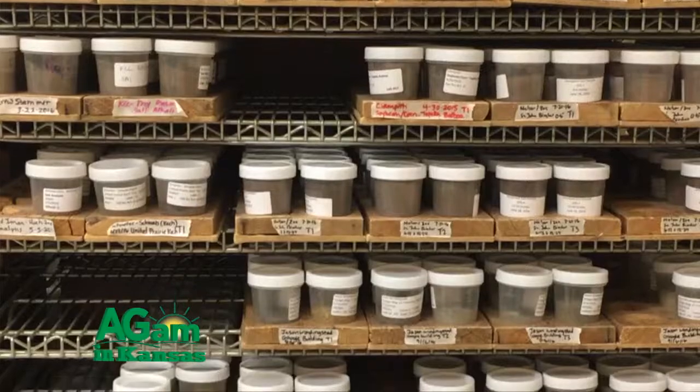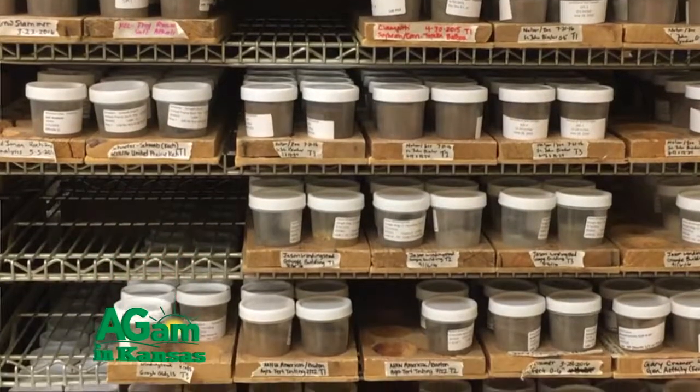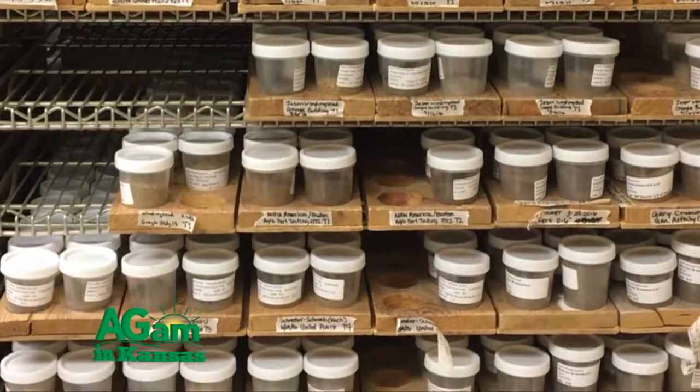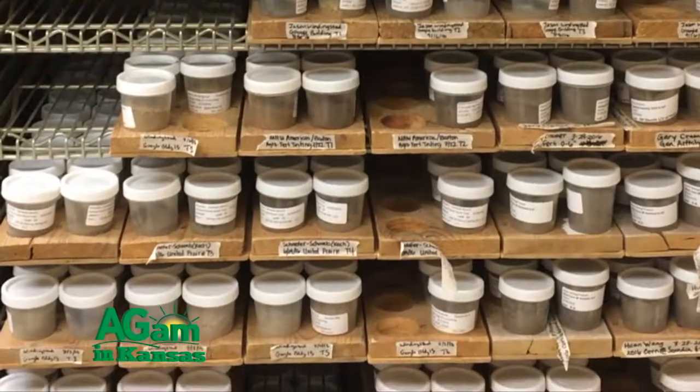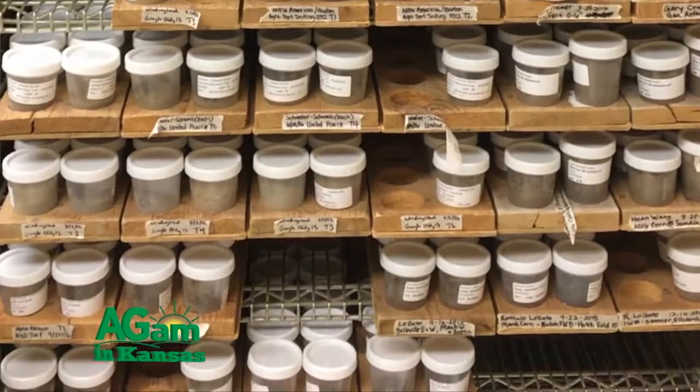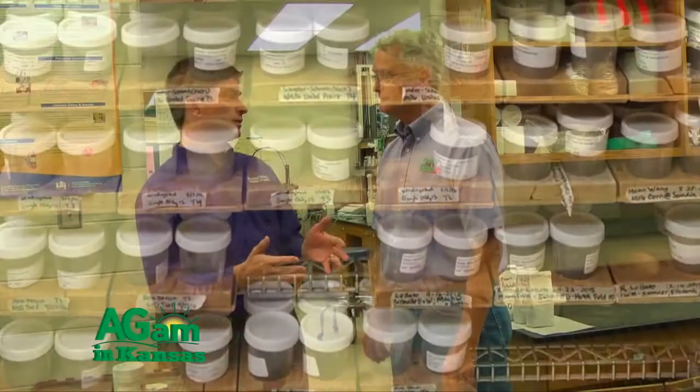Yes, our lab is probably a small lab compared, like you say, to other labs. In terms of volume of samples, we are probably analyzing about 30,000 to 40,000 soil samples per year, about 15,000 to 20,000 tissue samples, and 5,000 to 10,000 water samples. So those are maybe the main things that we focus on. Of course, we do get other types of samples, but soils, tissue, and water samples are the main things that we look at.